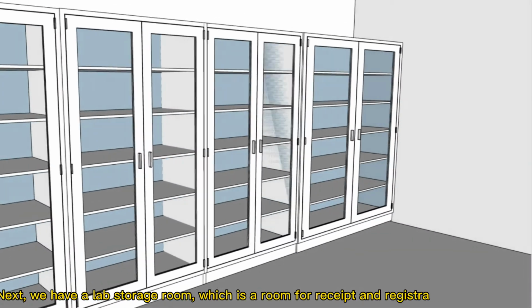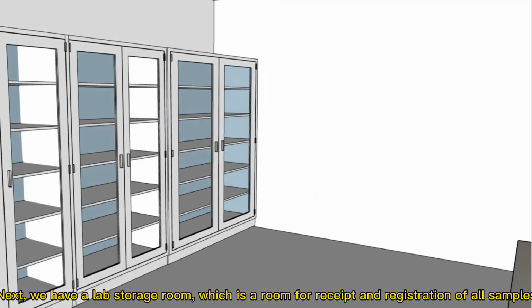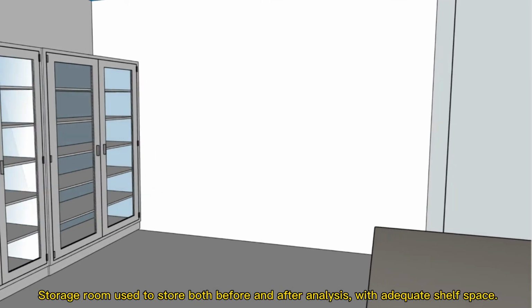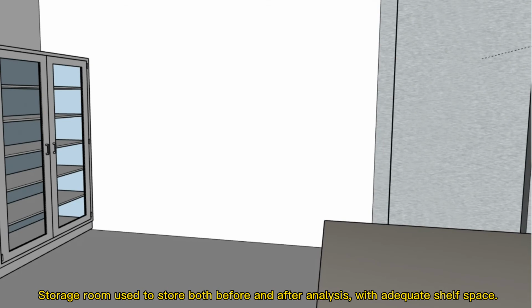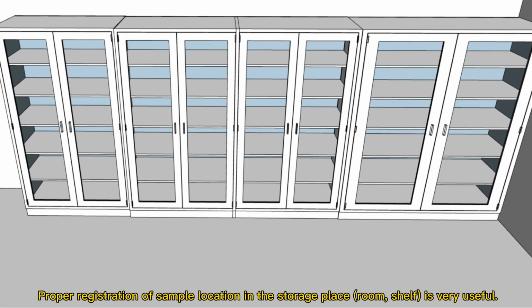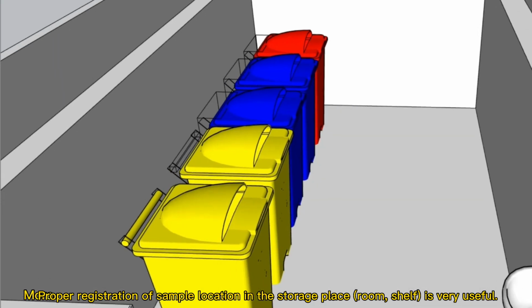Next, we have a lab storage room, which is a room for receipt and registration of all samples, with sufficient bench and shelf space to cope with the input. The storage room is used to store samples both before and after analysis, with adequate shelf space. Proper registration of sample location in the storage place, which is room or shelf, is very useful.